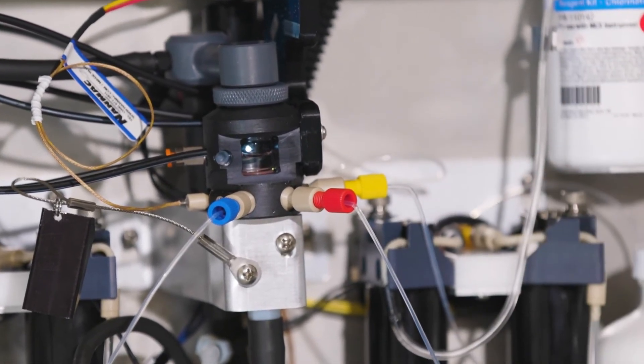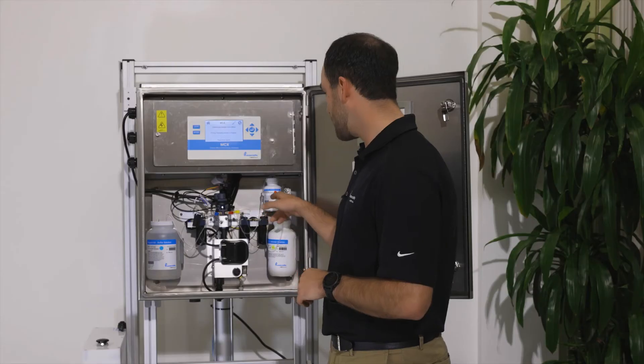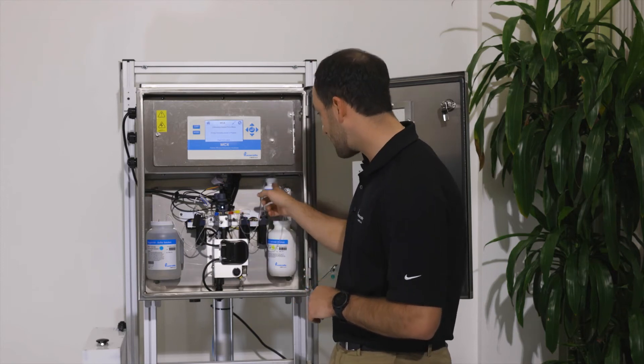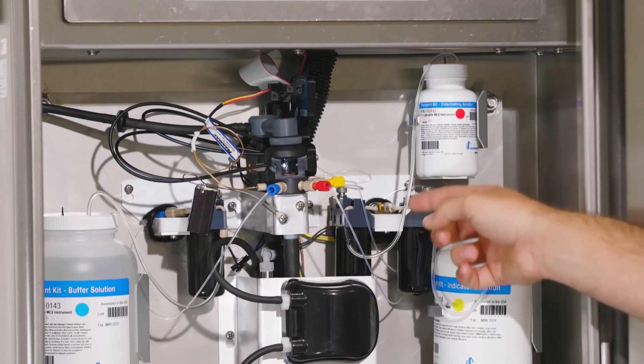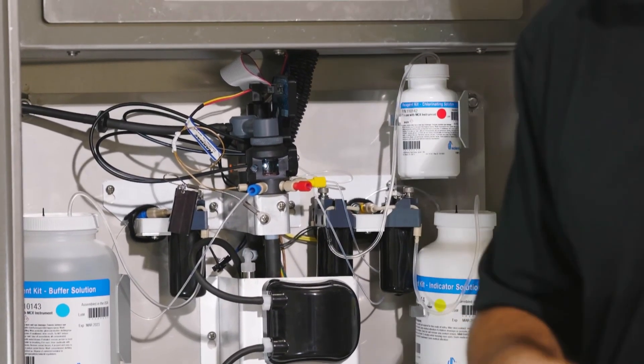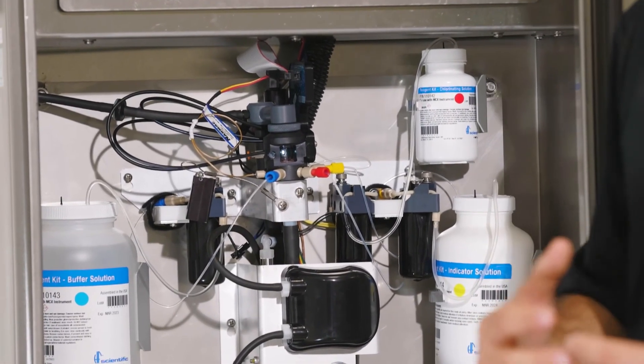What you want to watch for while you're priming your reagents is that you have liquid to start moving through the lines and into the cuvette. As you can see, the little air bubbles will travel through the line and eventually make it into the cuvette. This is a great way to troubleshoot and make sure that you're getting your reagents into the sample cell.